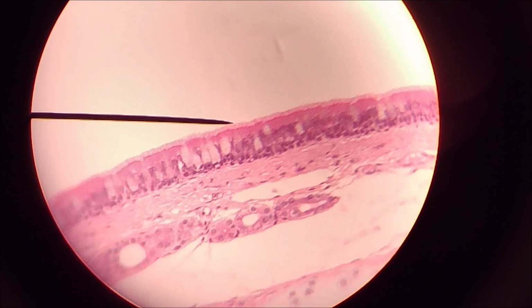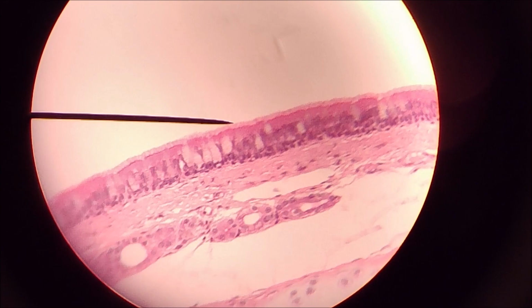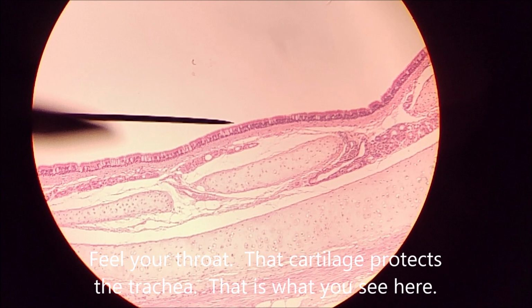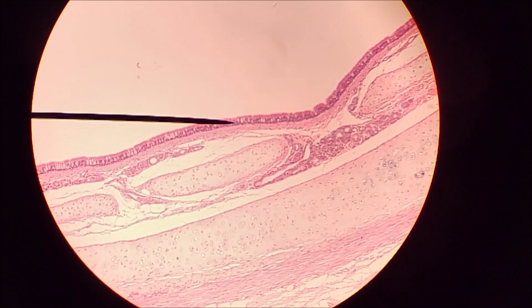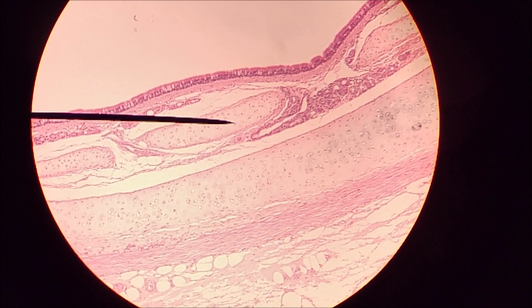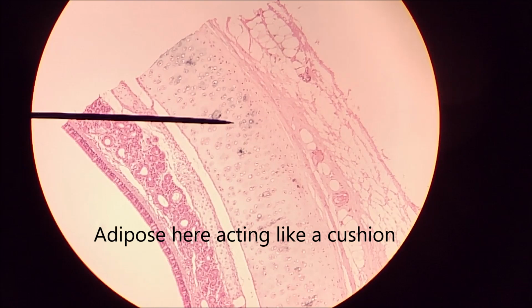What we have here is pseudostratified columnar epithelium, and I can zoom this out a bit in a second, but you can see the cilia at the top. I can zoom it out, and what you see here is the epithelial lining, and below that is the hyaline cartilage. All of this is hyaline cartilage that surrounds and protects the tracheal passages. There's some adipose over there, and it's all hyaline cartilage. This is a ring, you can see the trachea.